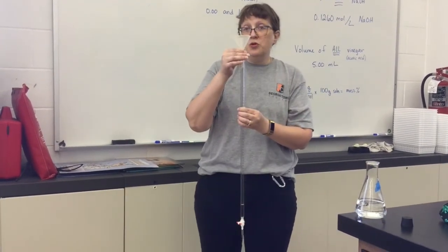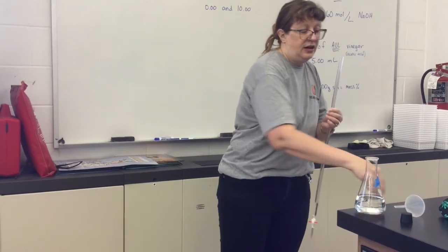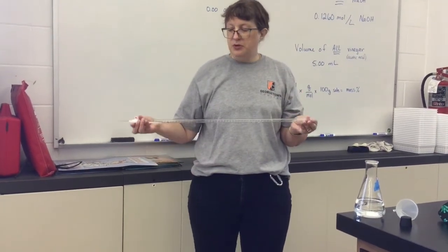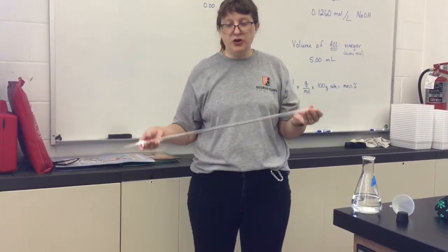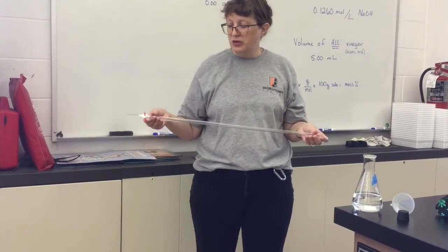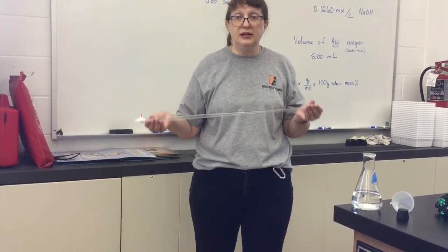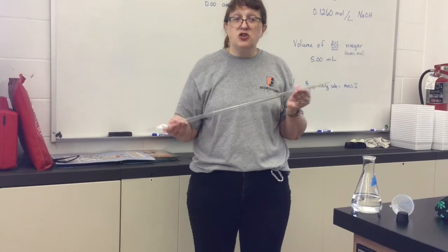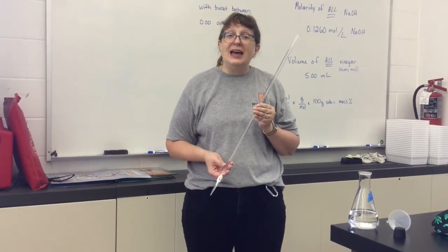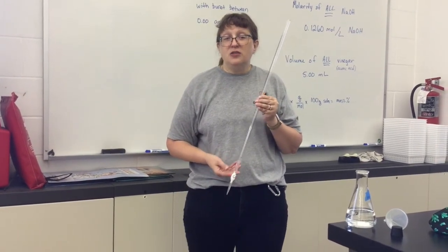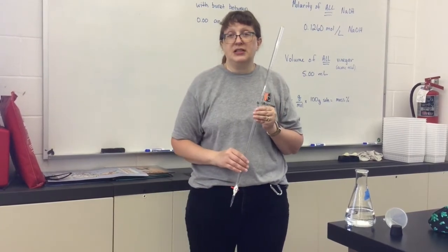Then you will remove the funnel and tip the burette back and forth a little bit, turning it as you do so that you can rinse out the length of the burette. After you do this, drain a little bit into the sink and then dump the rest out so that you can fill it with fresh sodium hydroxide.